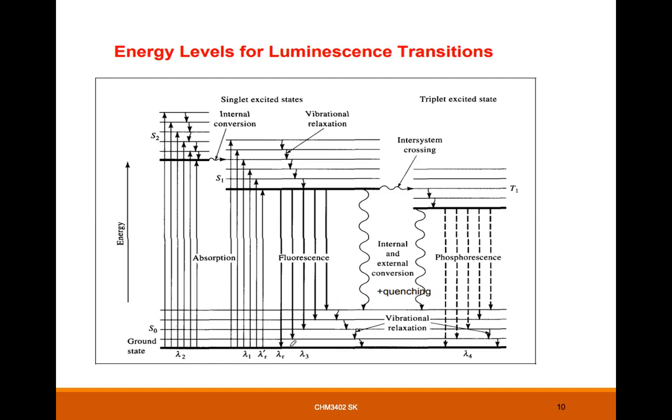Even here, the electron can decide to go straight to the ground, or from here take one more step through the vibrational levels of the ground state. So this vibrational relaxation does not emit any obvious photon.